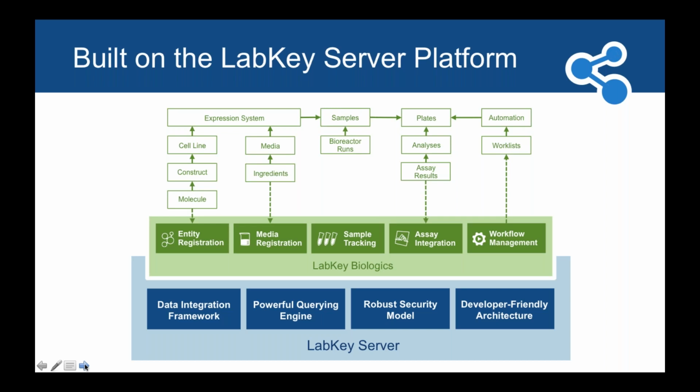Now, some folks are not necessarily as interested in that, but a number of folks very much are, particularly when we talk about optimizing bioreactor runs and being able to really improve the yield of antibody or protein or whatever it may be that you are developing within the lab. So we track media recipes and media batches if so desired in your particular deployment.